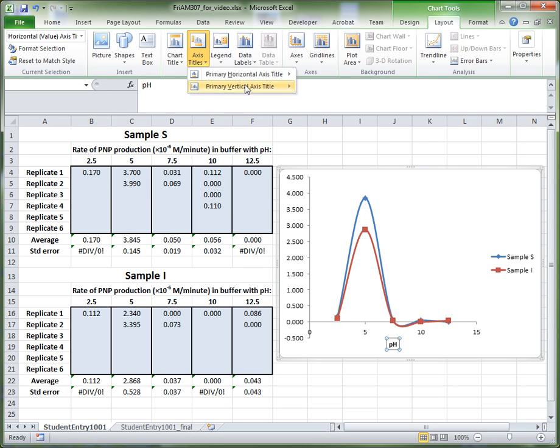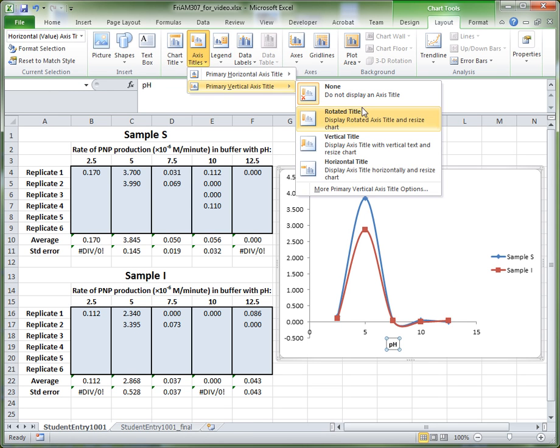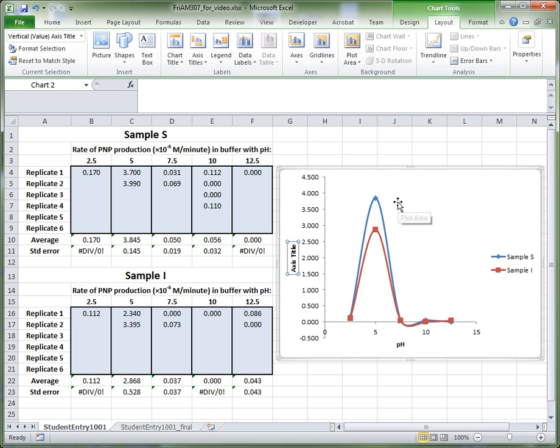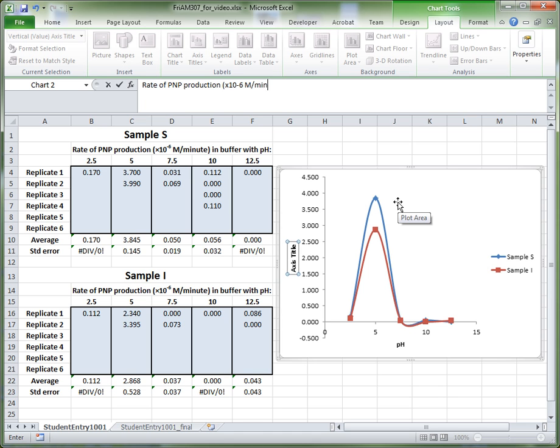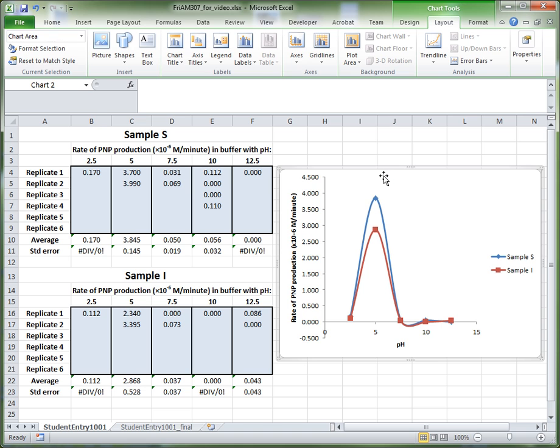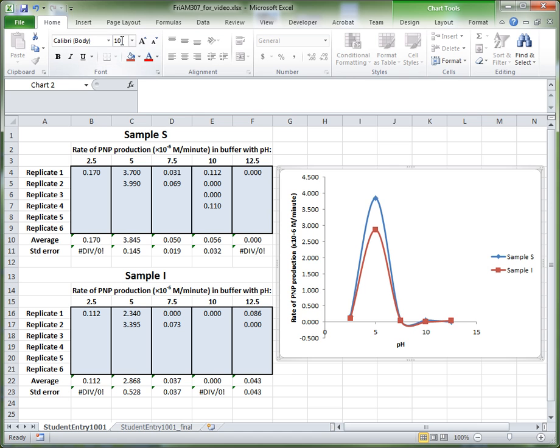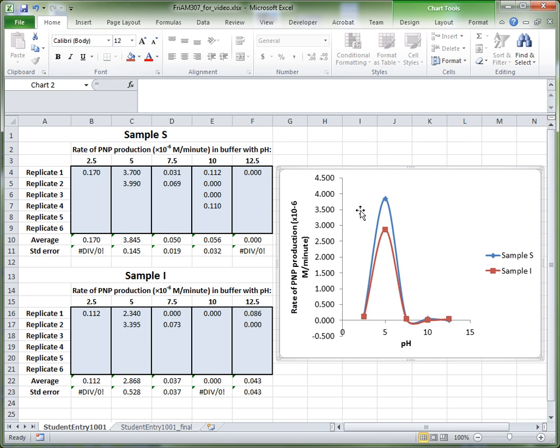Repeat this step for the vertical axis. Go to Axes Titles, then Primary Vertical Axis Title, and choose the rotated title option. The y-axis shows the rate of PNP production, and always include units if you can. The units here are times 10 to the minus 6 molar per minute. The font is a bit small, so go to the Home tab and change the font size — let's make it 12 to make it a little bit more visible.